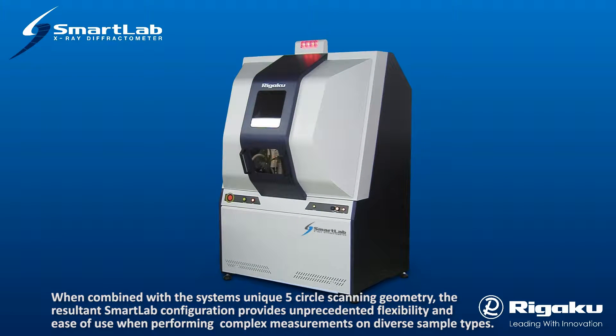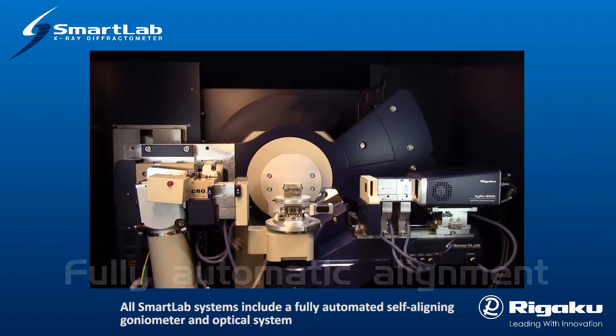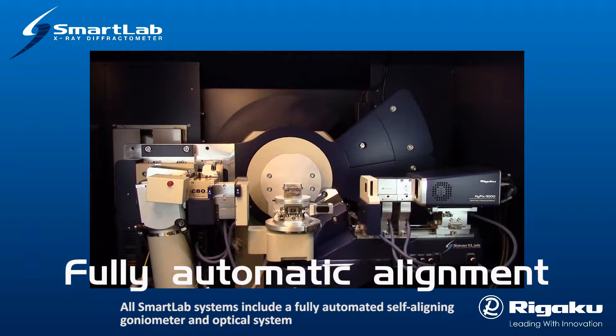When combined with the system's unique five-circle scanning geometry, the resultant SmartLab configuration provides unprecedented flexibility and ease of use when performing complex measurements on diverse sample types. All SmartLab systems include a fully automated self-aligning goniometer and optical system.